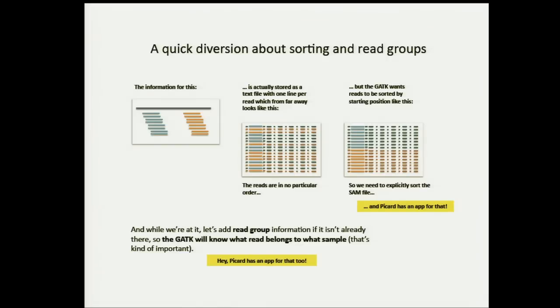Most of the time, you do not want to see repeated duplicate molecules. So it's not radical to actually remove the duplicates from the BAM file. We just don't do it because it's data and we want to keep it in there. But it's reasonable to do so.